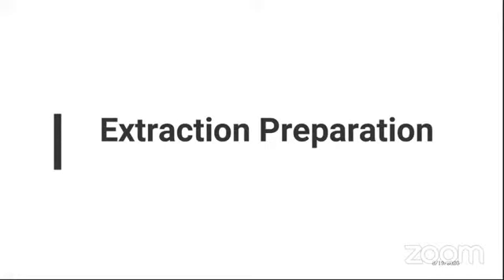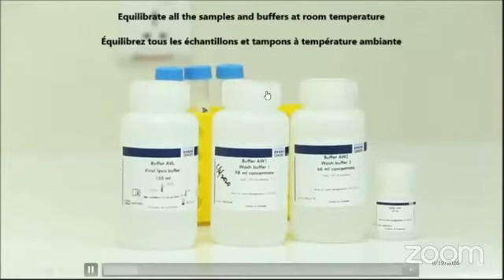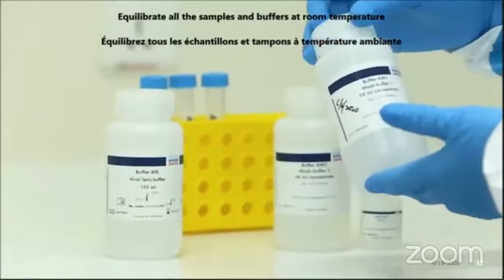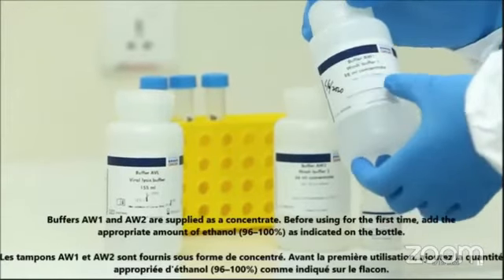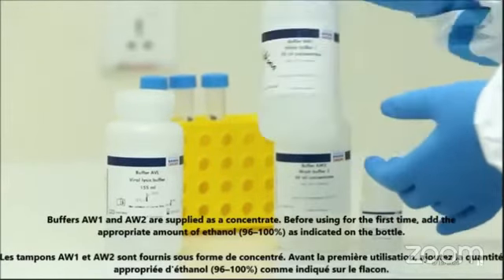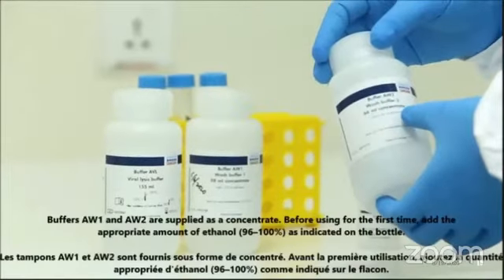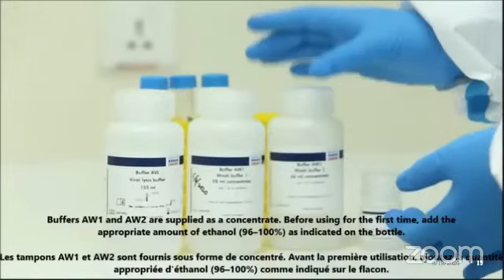Now we are going to start the manual RNA extraction. Extraction preparation. First of all, place all the things properly. Equilibrate all the samples and all the buffers at room temperature. Wash buffers AW1 and AW2 are supplied as a concentrate from the company, and they will be reconstituted by using the ethanol, which is indicated on the bottle.